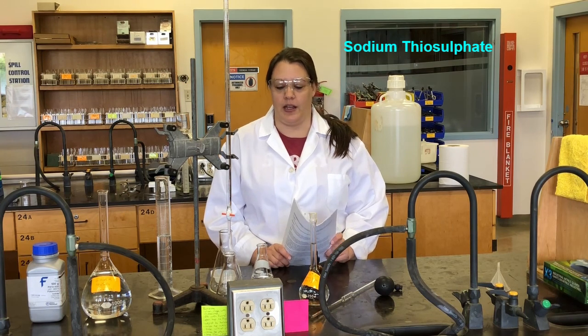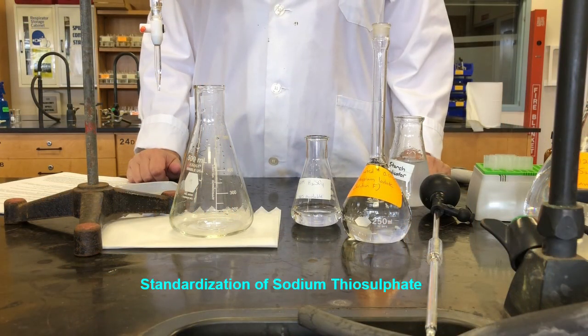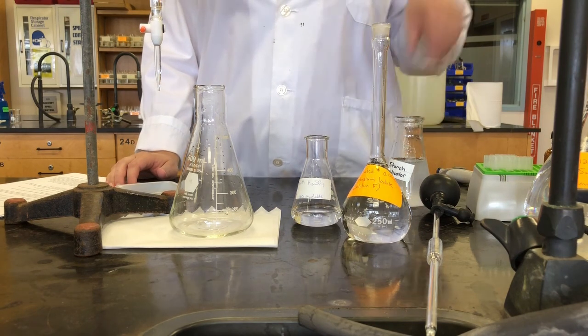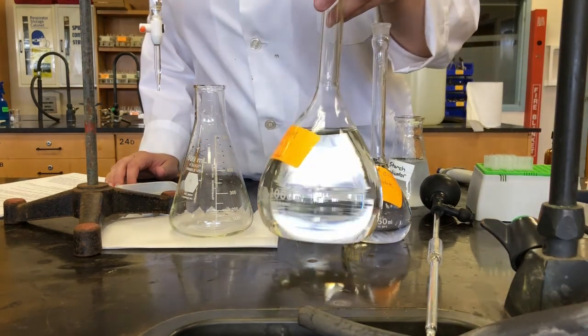Because we're titrating with sodium thiosulfate, we need to know the exact concentration of the sodium thiosulfate. So we're going to start by standardizing a solution of sodium thiosulfate to get the exact concentration. Okay, so we're ready to start the standardization of our sodium thiosulfate solution. So I've already diluted the stock solution of thiosulfate, the solution C.